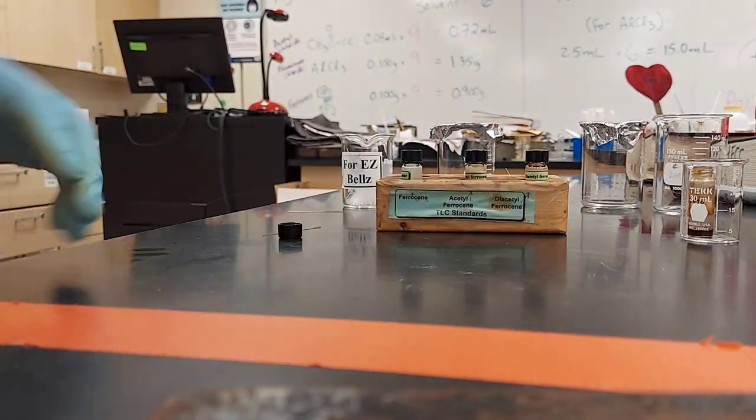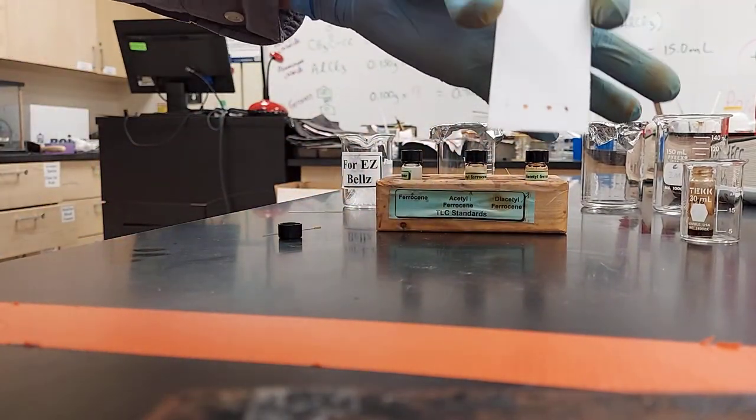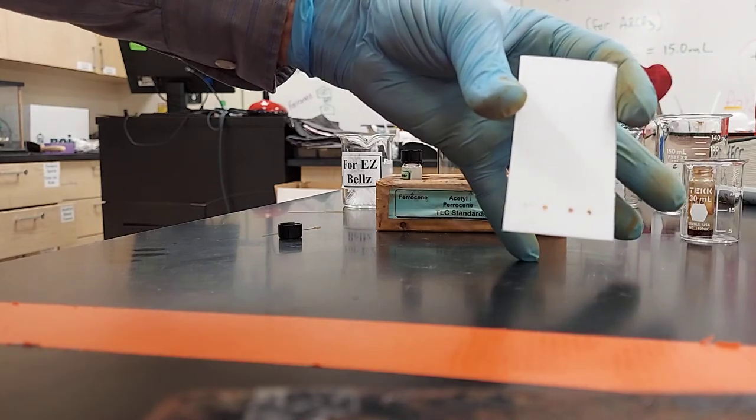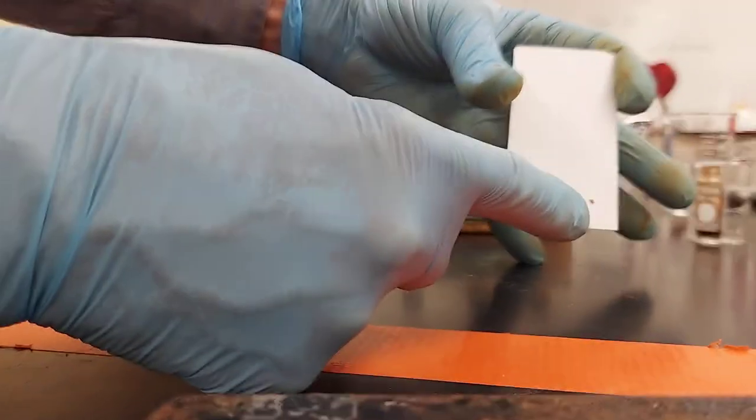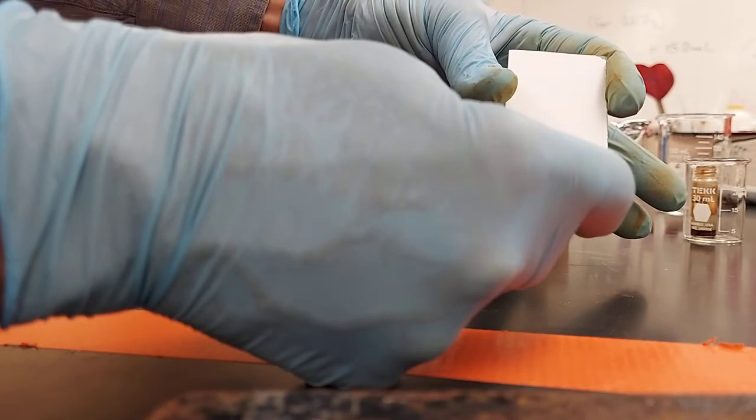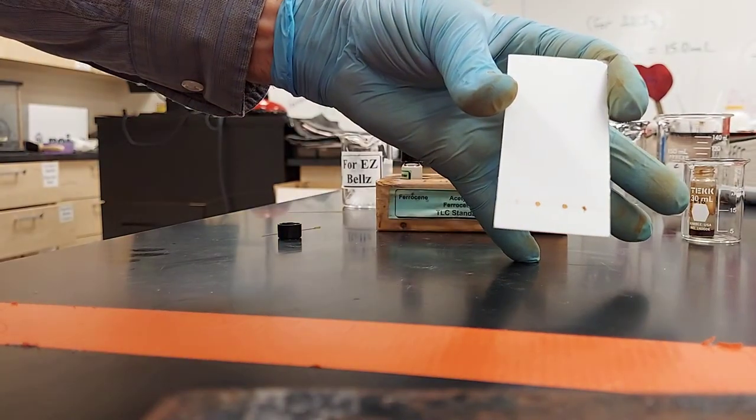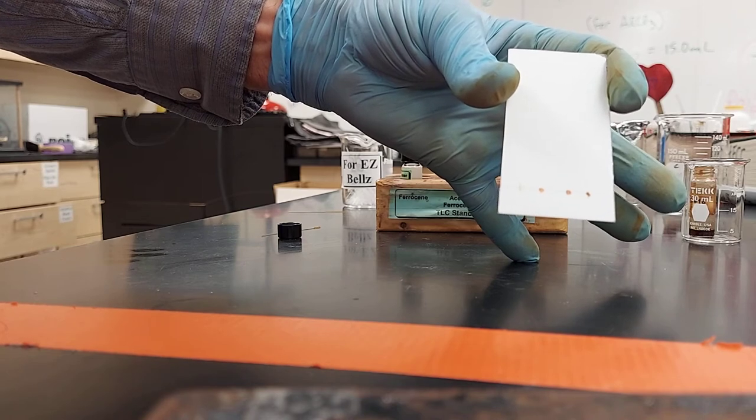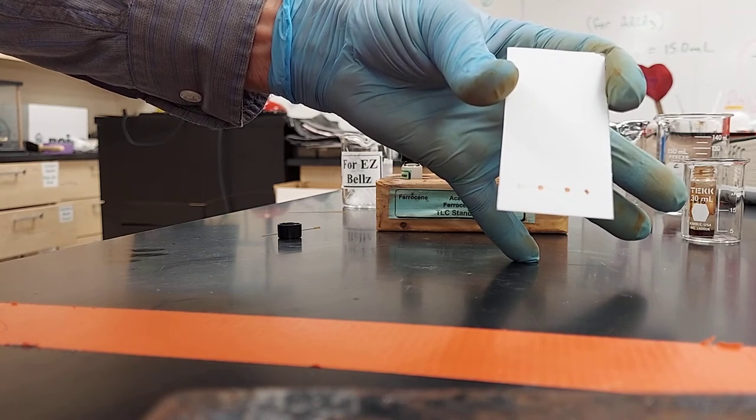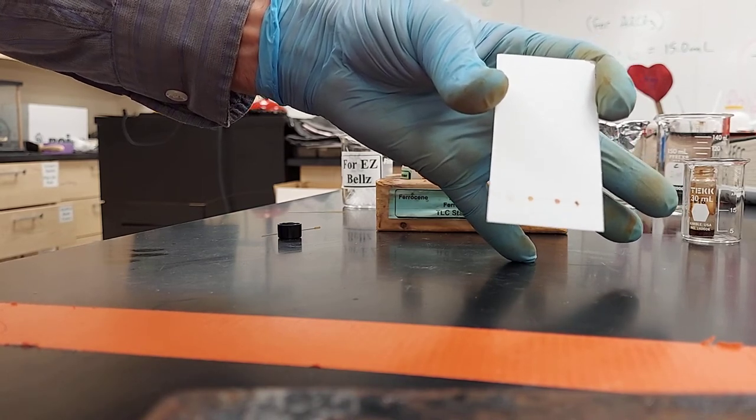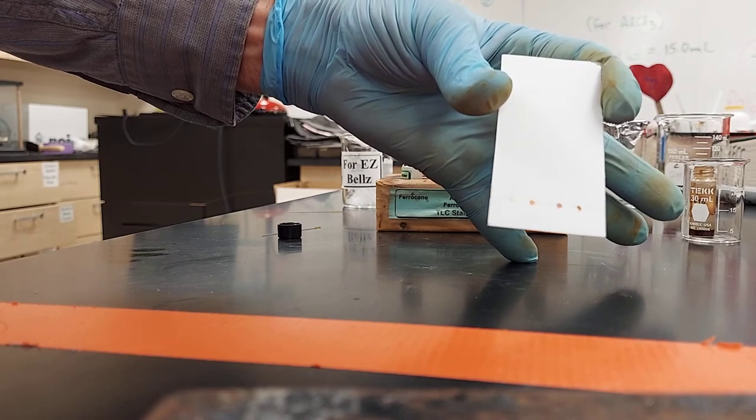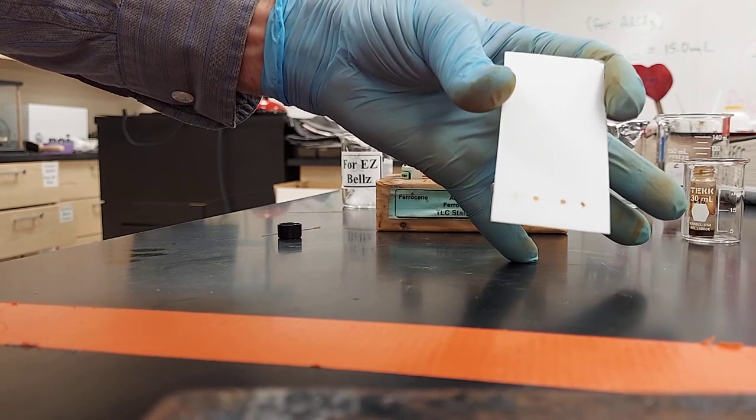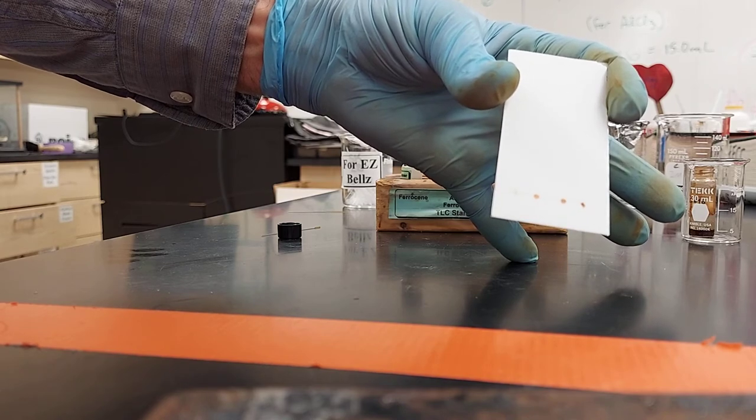So after we've finished our spots, it looks like this. Ferrocene, acetylferrocene, diacetylferrocene. And the unknown is a mixture of all three. Your only job on the unknown is to tell me which chemical in the mixture is the major chemical. To do that, we've got to develop our TLC plate.